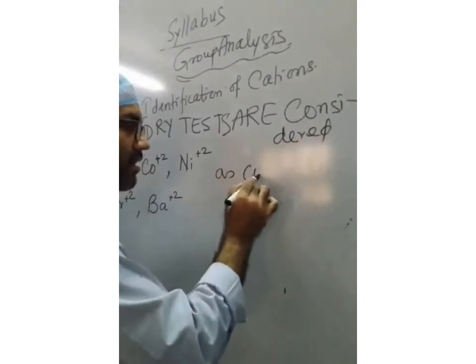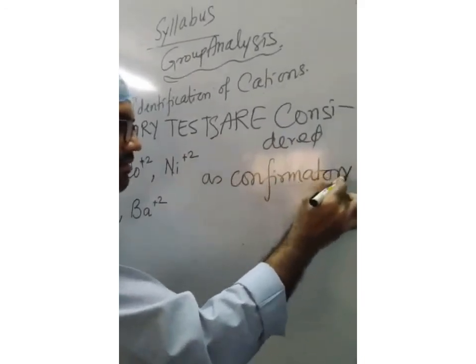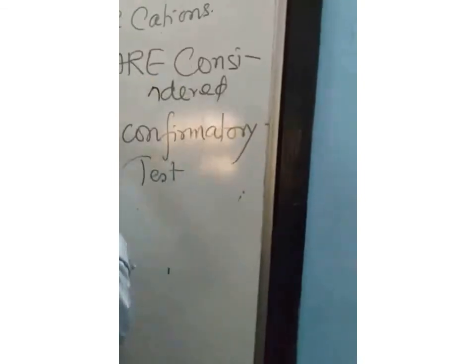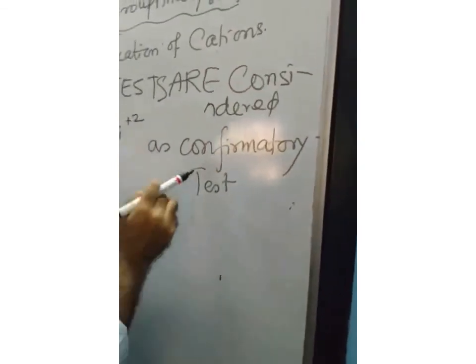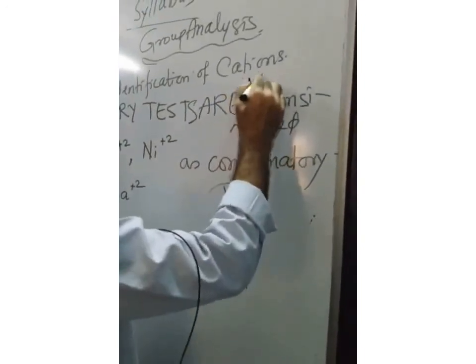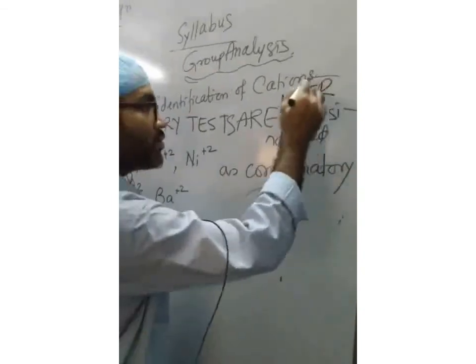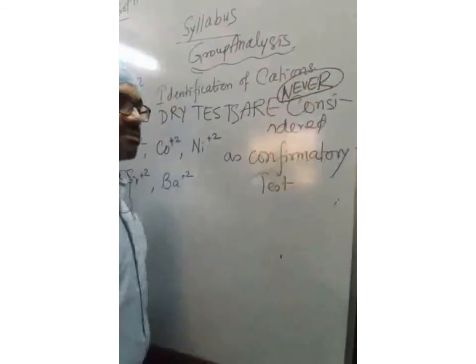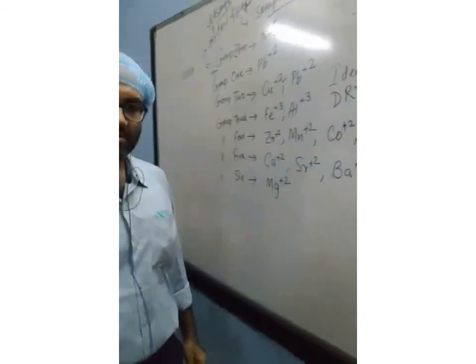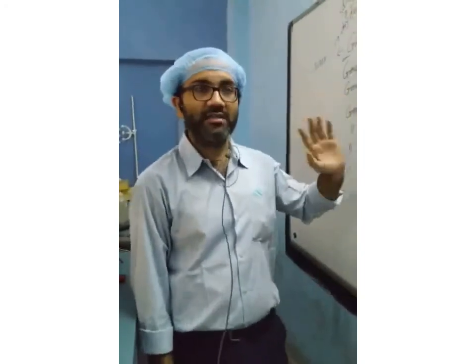Sorry, I made a mistake: dry tests are never considered, never, as confirmatory tests. So please, during the examination, do not write dry test as a confirmatory test.